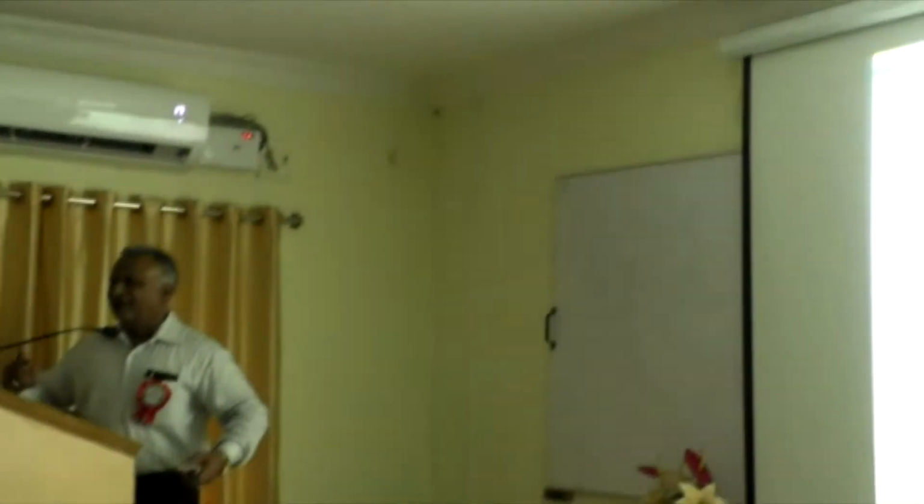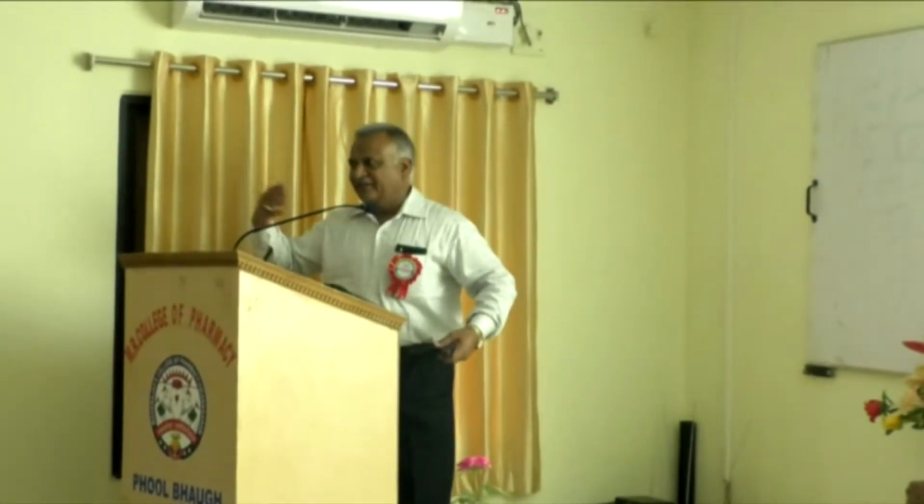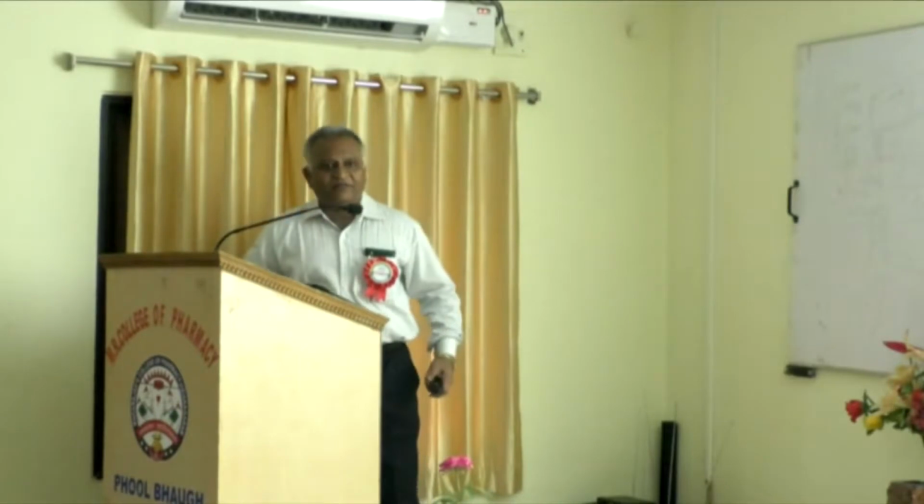And then photoluminescence, which we do regularly in our labs. You give a chemical light and then it gives you light. That's called photoluminescence. The luminescence is initiated by light. That is two different types of it.